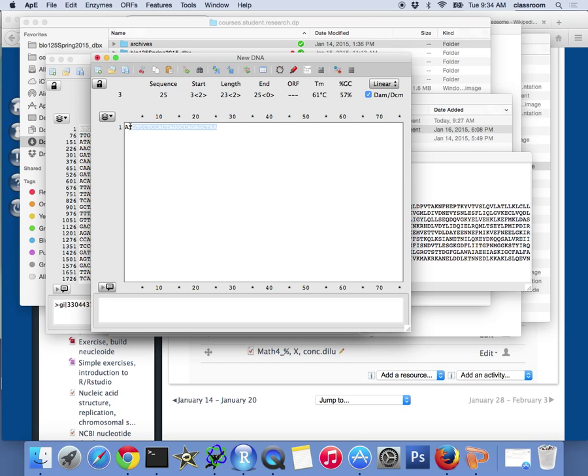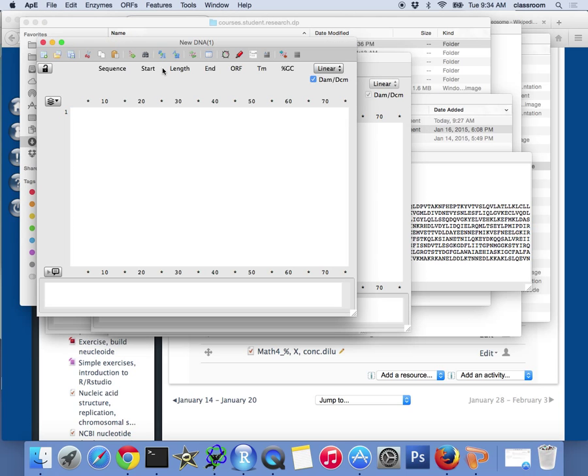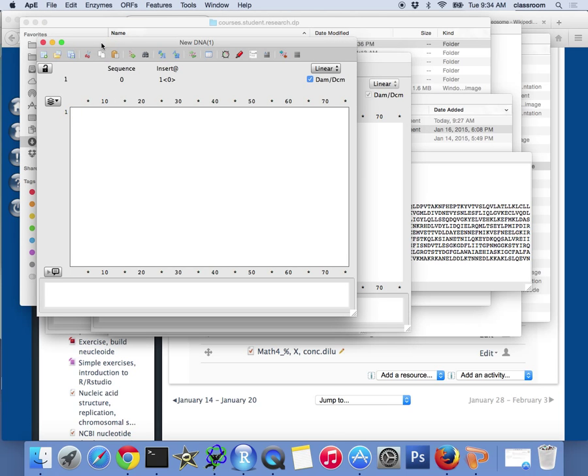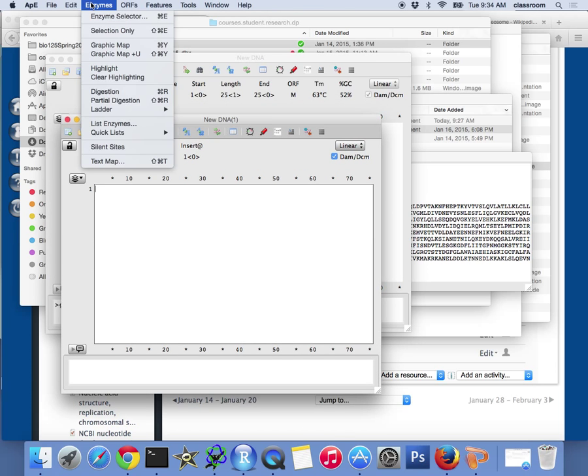So that's a small fragment of DNA right there. I select this and I'm going to go to a new sequence again.